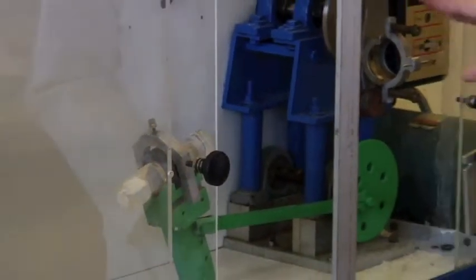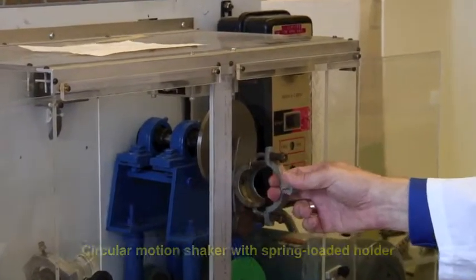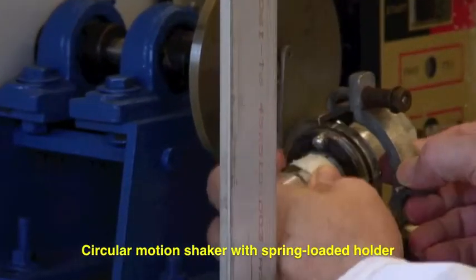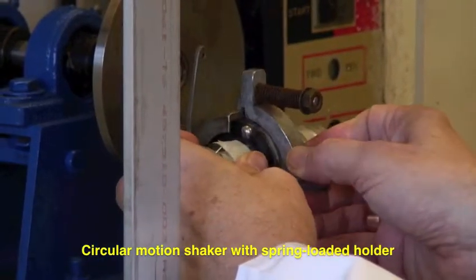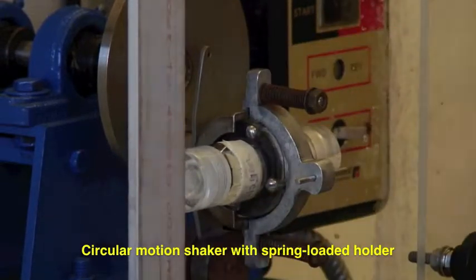The circular motion one is a little easier. You just pull the bracket out, place the cell in place, and then the springs will hold it.